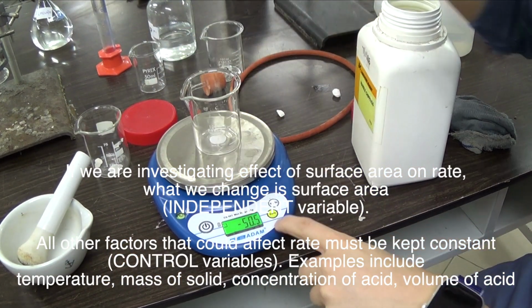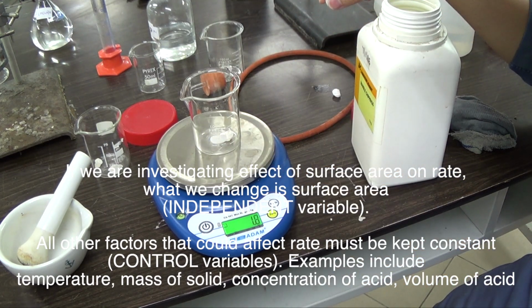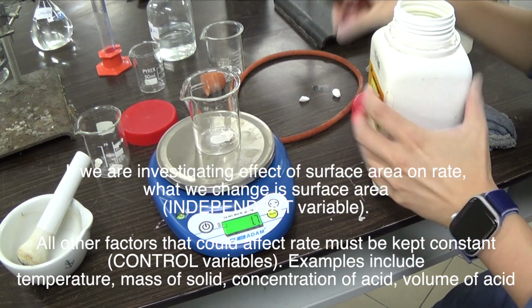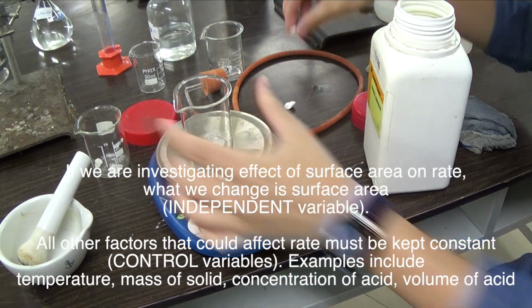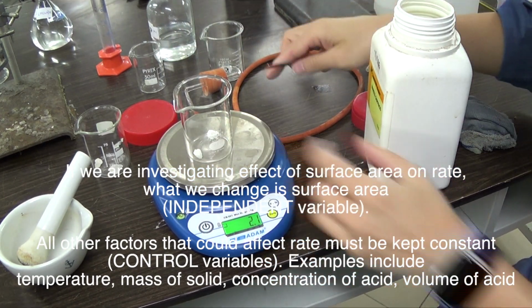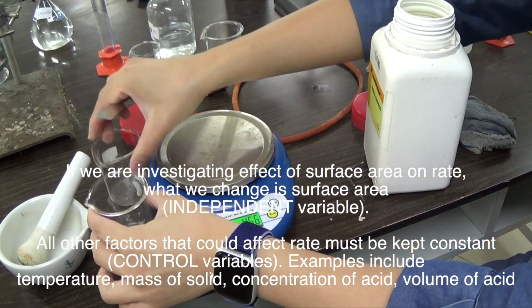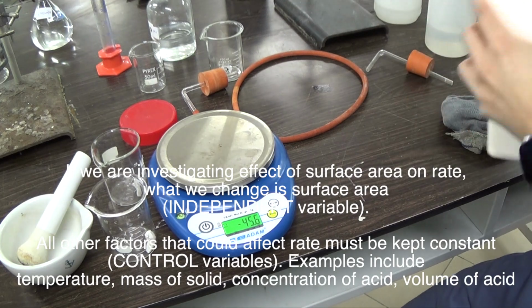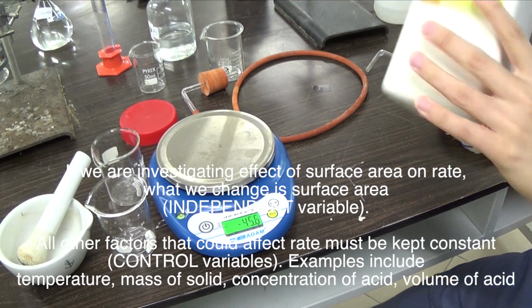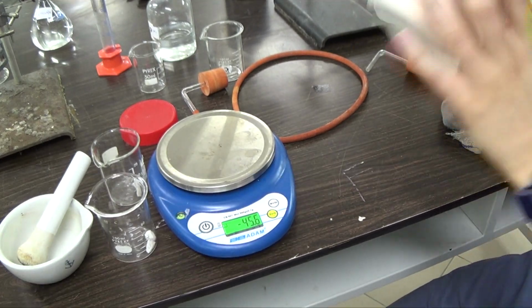Previously, I had 1.8, 1.7. I wonder if I should start from 0. So this is 2.1, 2.0, and this was also 2.0 just now. So they both have the same mass of this solid. It's important that we recognize that this marble chipping is actually calcium carbonate.